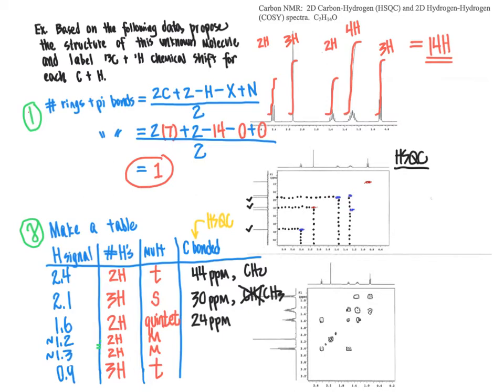And so filling that in and putting these in the appropriate order, it looks to me like if we very closely compare the blue signal here to the one here, this one appears slightly further downfield, slightly further to the left, and this one appears slightly further upfield to the right. So I'm going to plug this one in at 1.2 and this one in at 1.3.